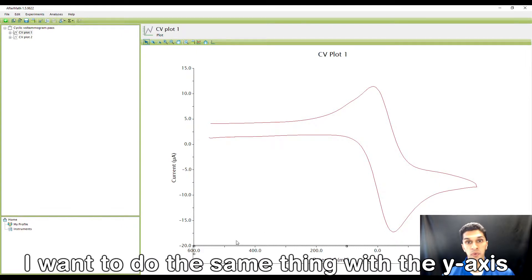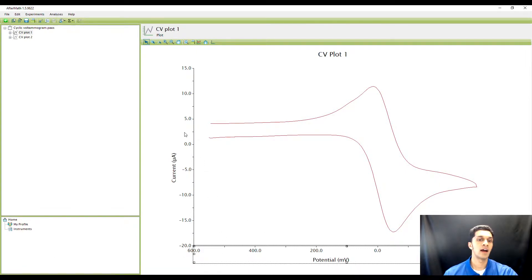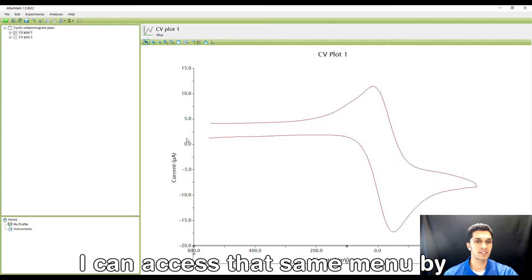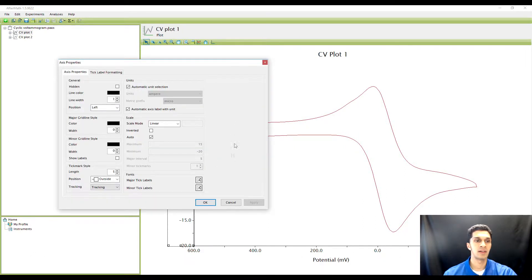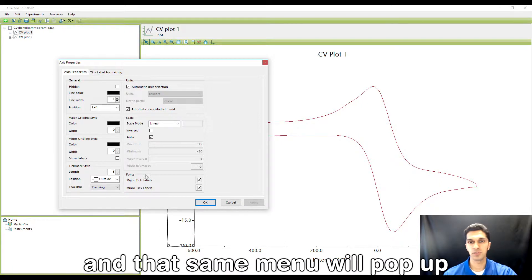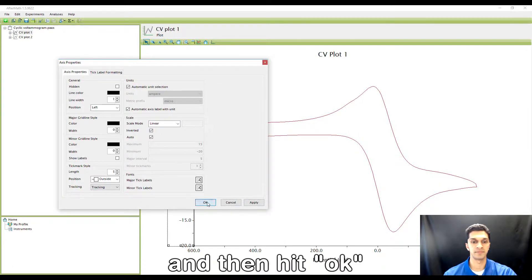I want to do the same thing with the y-axis for current. I can access that same menu by right-clicking and then selecting Properties, and that same menu will pop up. I'm going to click the inverted button and then hit OK.